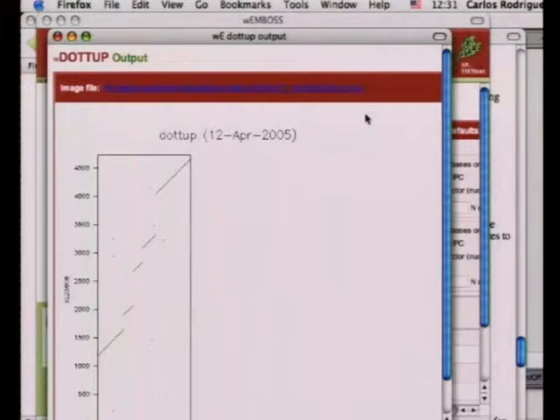So if you've got a set of sequences that you use frequently, you can save them into this nucleotide list or protein list, and then you can operate on them through any of the programs by simply selecting them from the list. Like I said before, if you've got some sequence here, you can also upload it into the analysis routines and then save it for further analysis. That's probably the easiest thing to do.